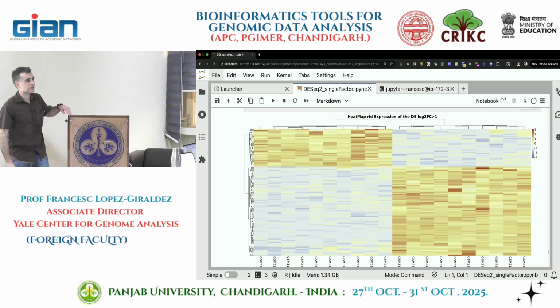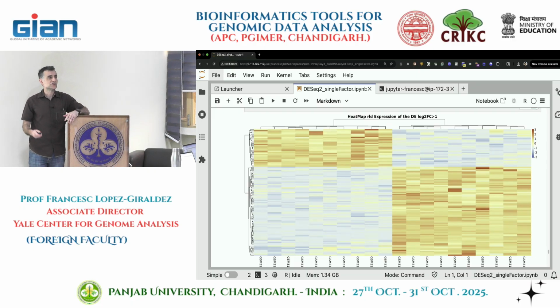So that's what I was saying about that paper. That paper showed 10 genes. And if you do the clustering, right, you're selecting genes that create differences. So it's expected that you're going to get a good clustering because we are selecting the genes that are different, and you get a beautiful separation, right? And you have really blue sections, really red sections. You're selecting genes that are already creating that difference.